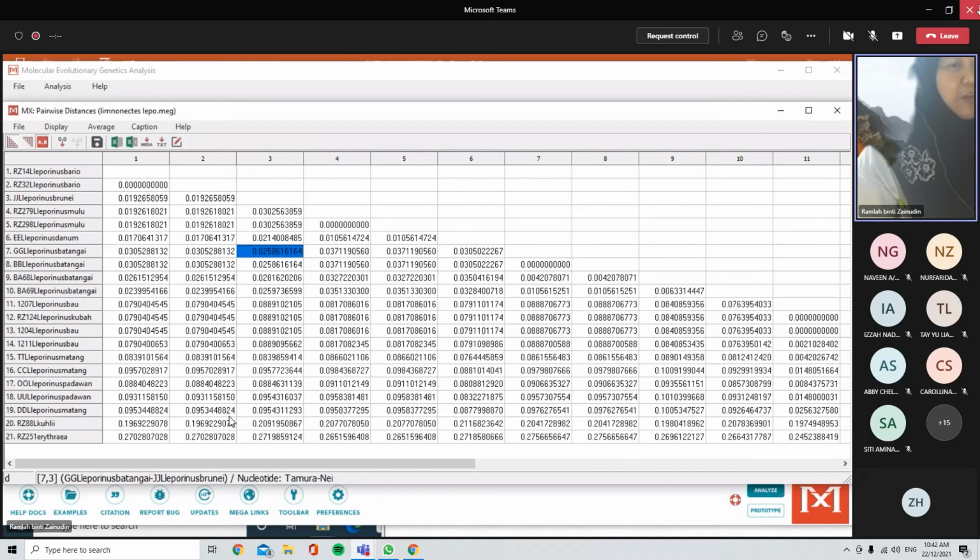Okay, itu maksud dia. And then you can look at within Mulu saja, what is the range, and within population, Mulu to develop answer. So this is you have to play around with the punya distance. This is dipanggil sequence distance.